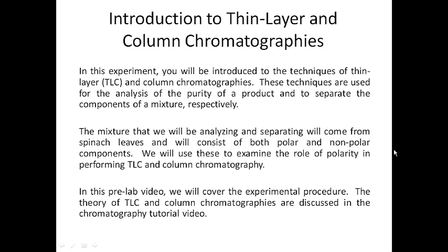So really what we're going to do is examine the role of polarity in thin layer chromatography, and then we're going to separate the pigments using column chromatography. And so I'm going to talk about the experimental procedure, and there's a second video that deals with the theory of thin layer and column chromatography, just the basics.